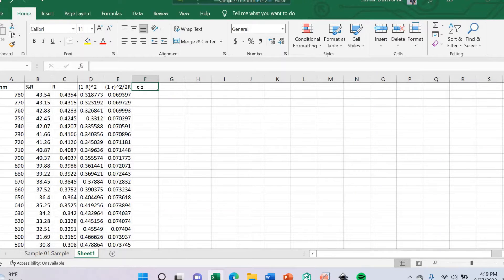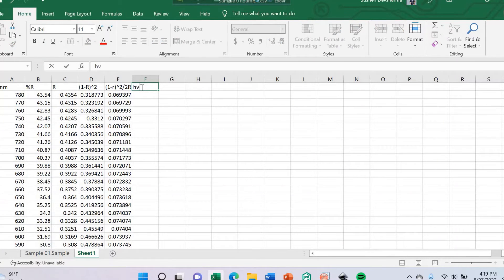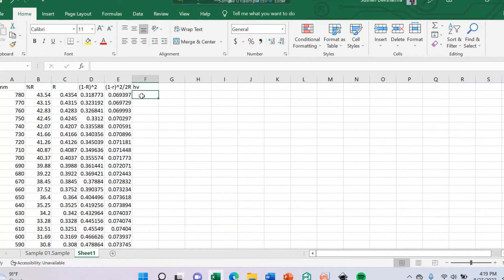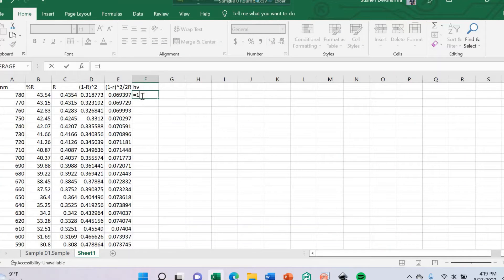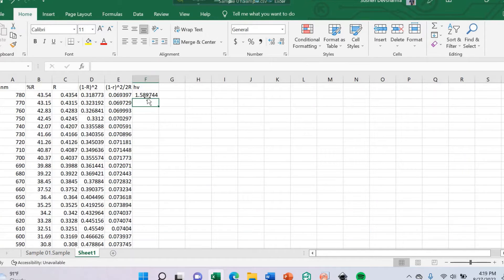Now we can determine hν (photon energy). We can calculate hν by following this formula. This is my hν value.